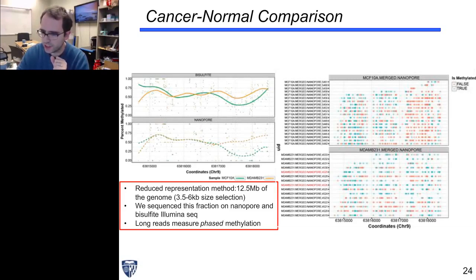Note that it's not just that you're getting an increase in methylation here in the differentially methylated region. Instead, it looks like this entire read is pretty blue. The entire read got methylated. So that entire molecule, in a non-local way, got an increase in methylation. This might say something interesting about what's happening in the epigenome of cancer samples, in that there are entire stretches of the genome that are getting aberrantly methylated.